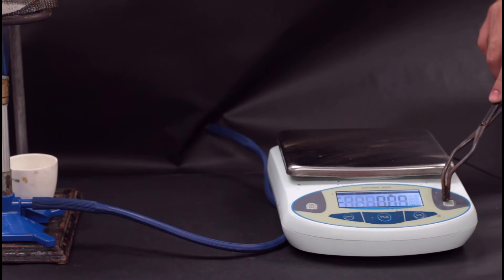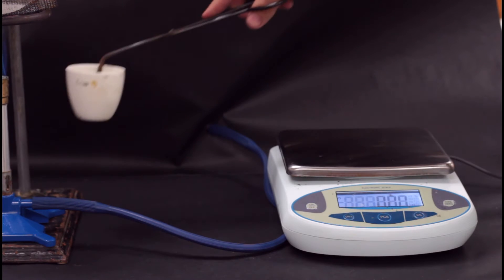Anytime we look at changes in the mass of a substance from a chemical reaction, we are doing a gravimetric analysis.